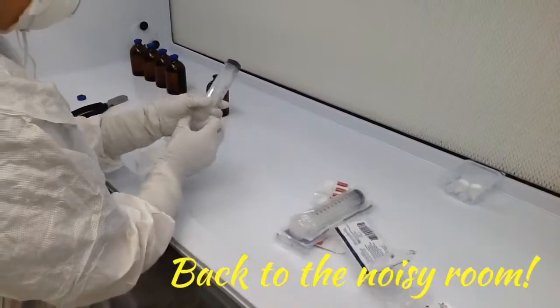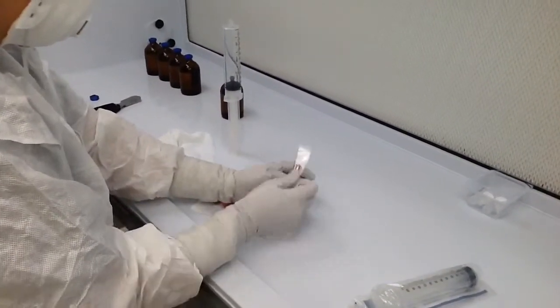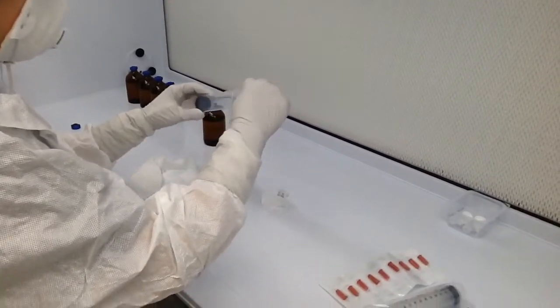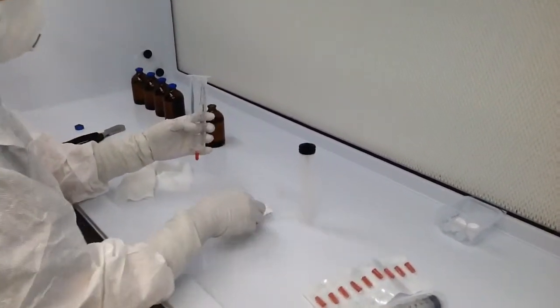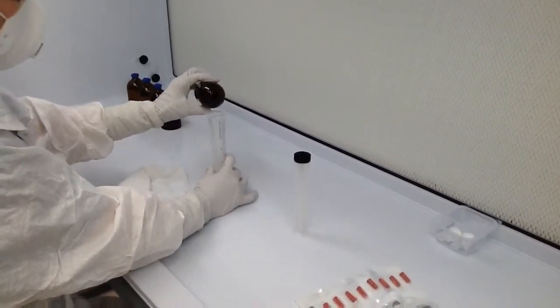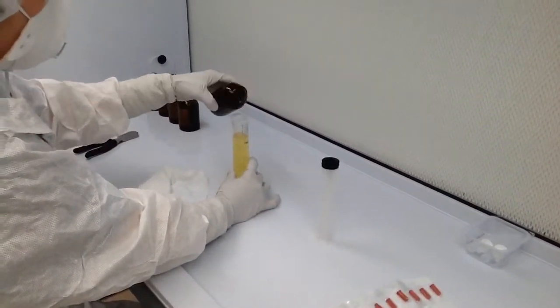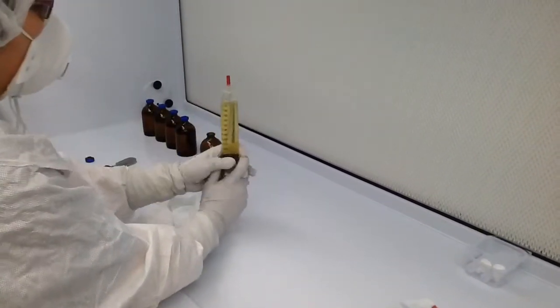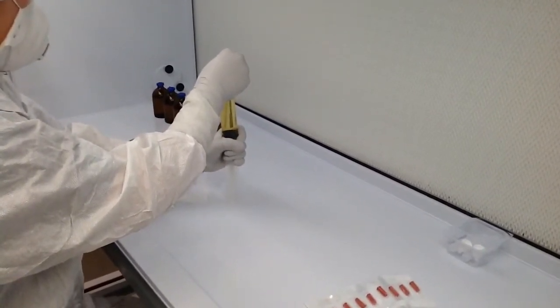So the next part of our ophthalmic is the vials have been cooked, everything is sterilized, and now we are going to fill the syringe with the eye drop liquid, the oil liquid, and we're going to be putting them into the eyedroppers. The best way to fill the syringe is to backfill it. And we have put a sterile cap on the opening, and we're pouring the solution into a 60 milliliter syringe. Getting the air out.